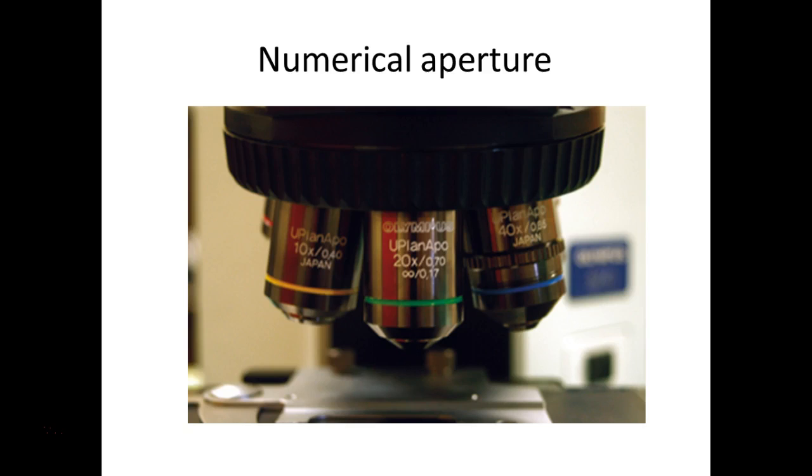So it is those two numerical apertures added together, divided into the wavelength of light at the top of your equation. If you look at any of the microscopes we have in the lab, although the image doesn't look blue, if you look below, there's usually a blue filter. That gives you the smallest wavelength of light and the best, clearest image. But the image is not going to appear blue, right? We're filtering the blue light.